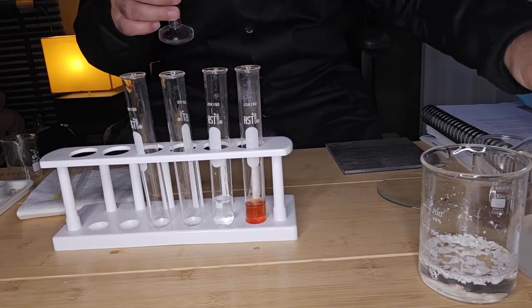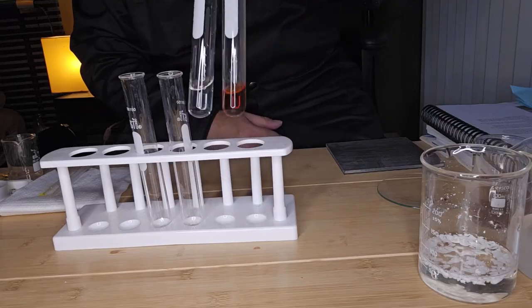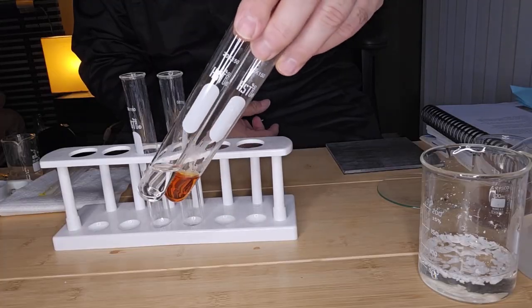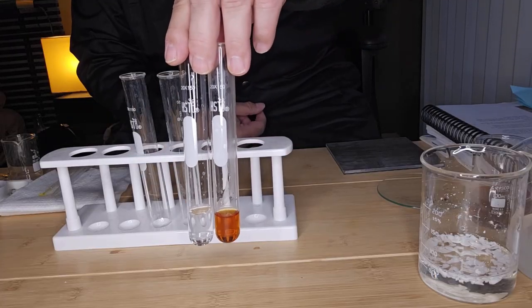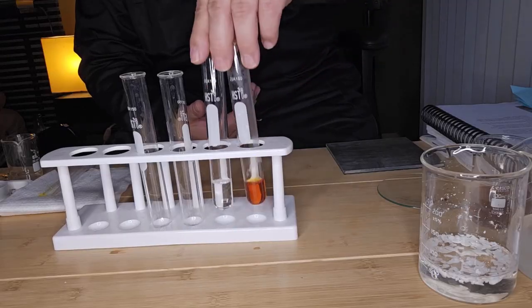They both look like solutions. One has a color to it, the other is a clear solution, but not very remarkable to say. Which one is a colloid and which one's a solution, you won't be able to tell.